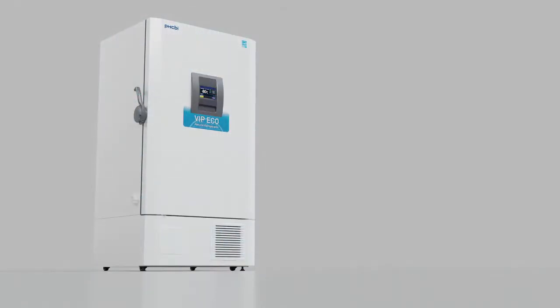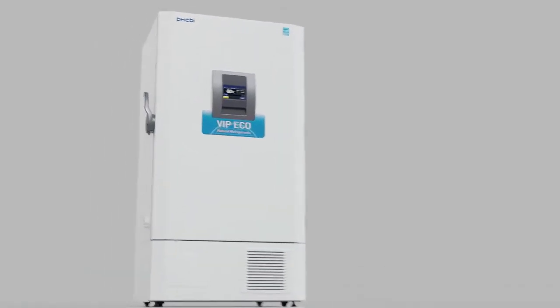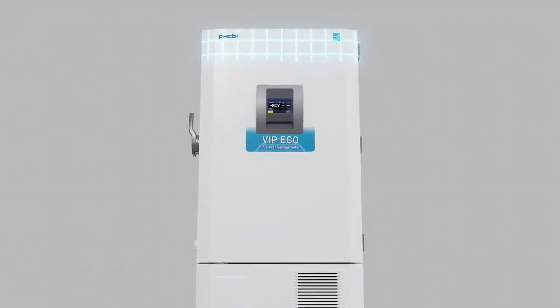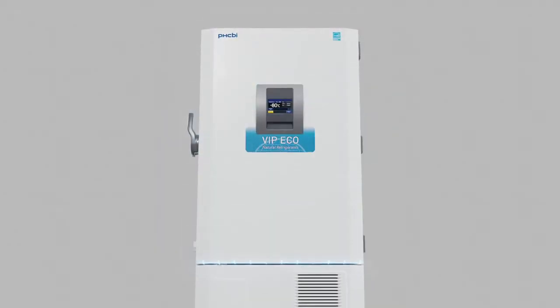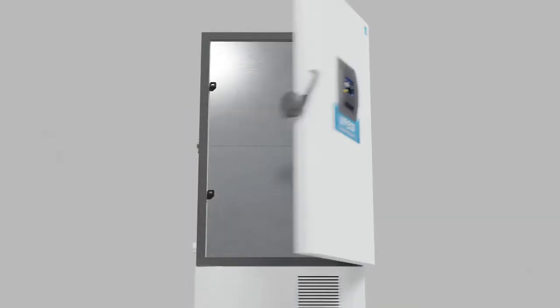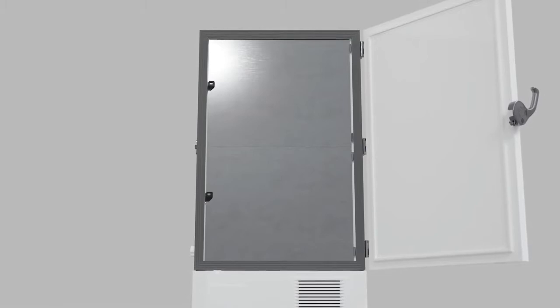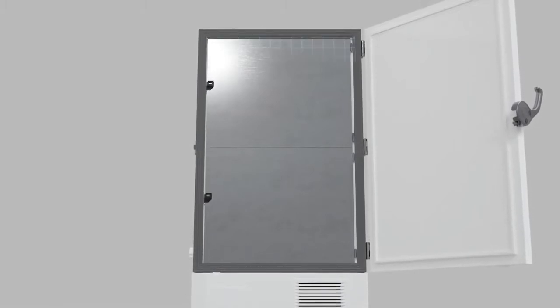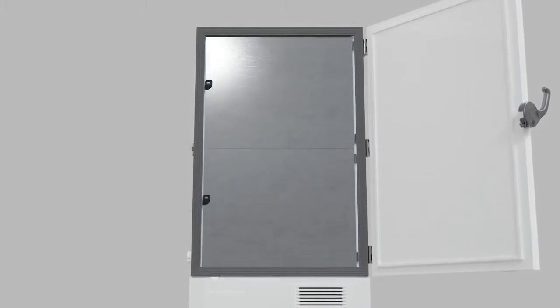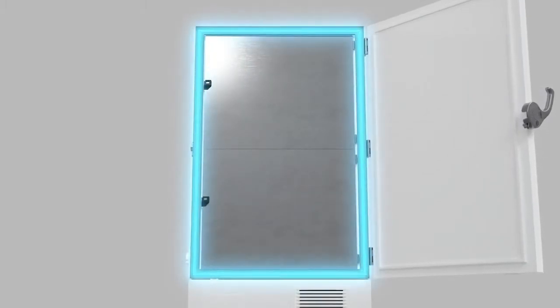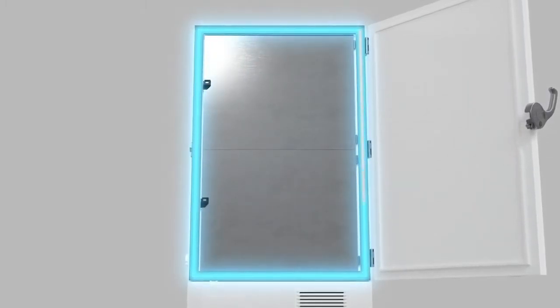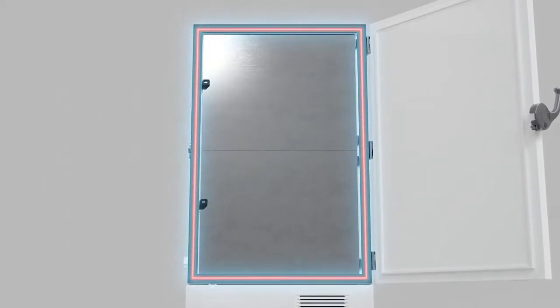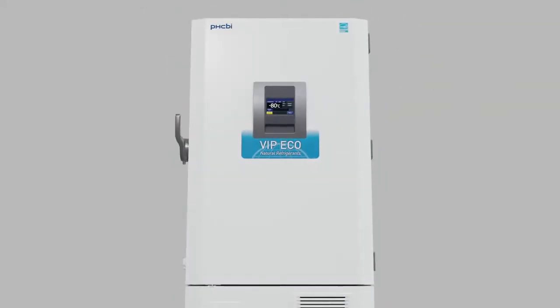The brilliance begins with the exterior. The VIP eco's cabinet design is actually an advanced frost control system. Sealed insulated inner doors, multi-layer gaskets, and gentle heat around the frame all work together to provide superior frost control.